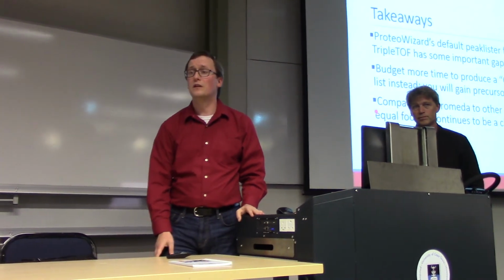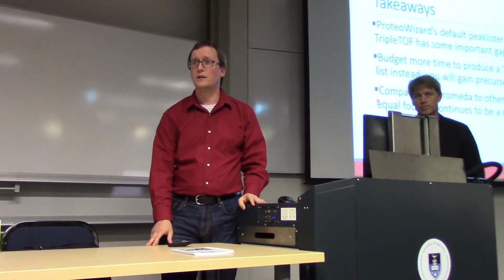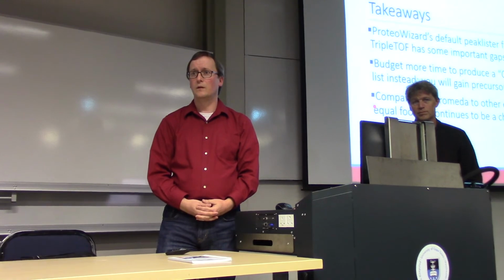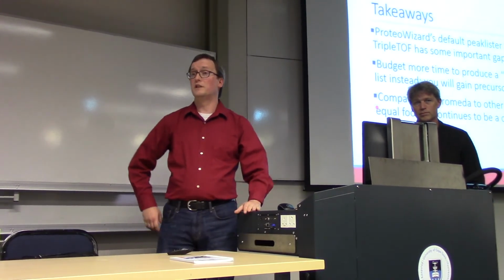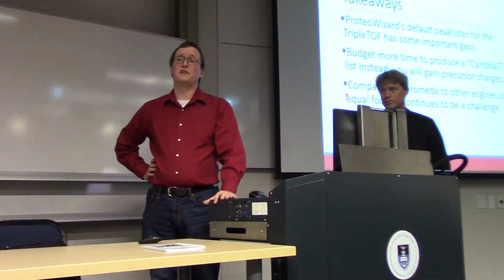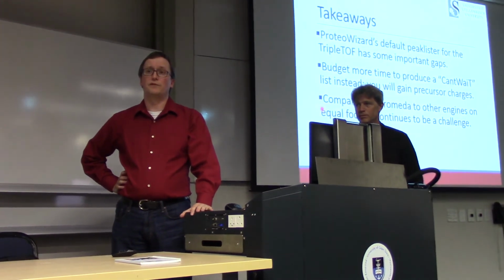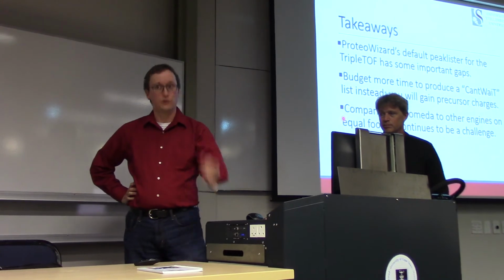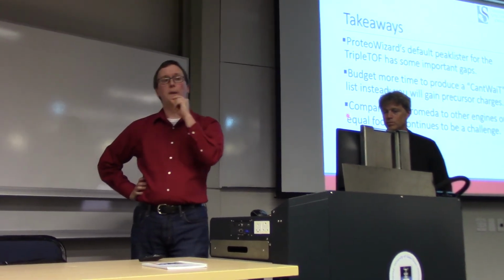Yes, sir? And if one had already a spectral library for all the proteins that you were interested in, then you could look at the abundances of these proteins? Yes. Yes, absolutely. The trouble is that there's relatively small amounts of information-dependent acquisition sets for QTOF, for TripleTOF specifically.